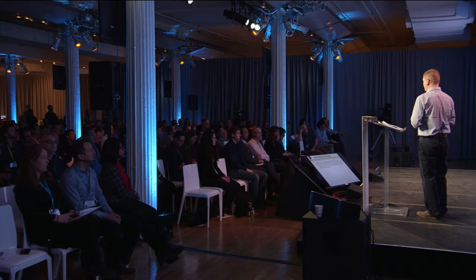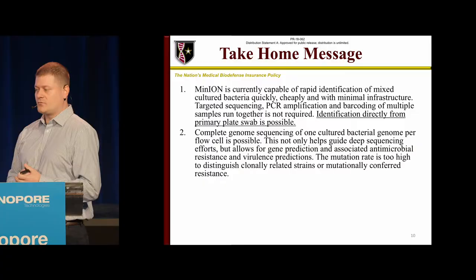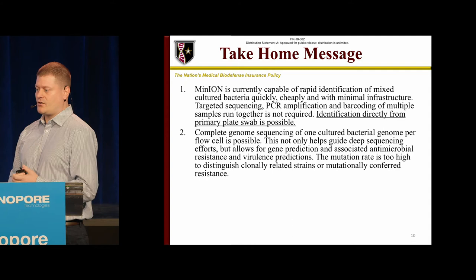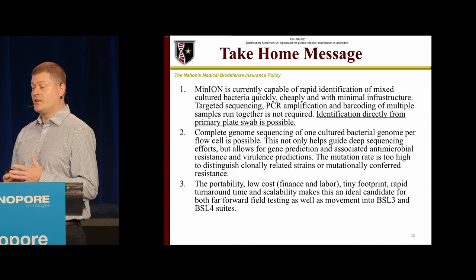We're working on that. And complete genome sequencing does produce an accurate, circular, good genome with good structure. I don't know if I'd do SNP-based analysis or antimicrobial resistance based on SNPs, but I would do the overall phylogenomics and things like that, which are pretty doable. And then the portability, low cost, and all the other characteristics that you guys are aware of make it not only applicable for field settings, but potentially moving into our BSL-3 and BSL-4 suites, which is our next step.